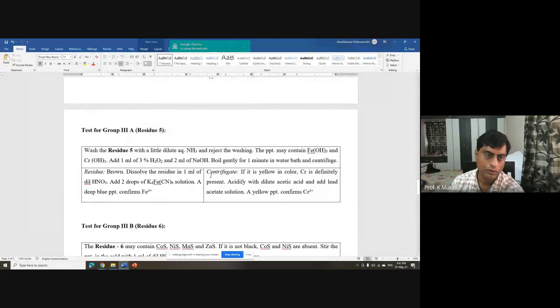Okay, so you are adding the ammonia, liquid ammonia, and rejecting the washing. Reject the washing means that basically you are adding dilute ammonia solution, and that liquid part will be thrown out. Only the precipitate you are taking. So that is having ferric hydroxide and chromium hydroxide here. So I'm repeating it. You are washing the residue with the dilute ammonia solution and throw that liquid part. So only take the precipitate again, right?